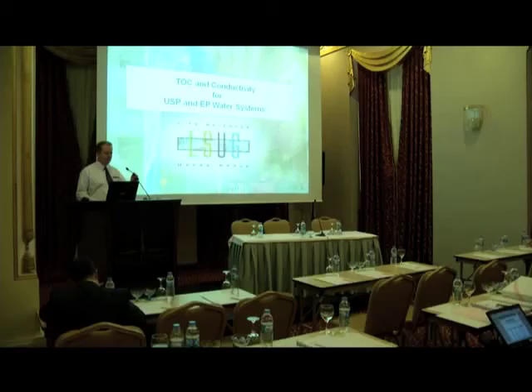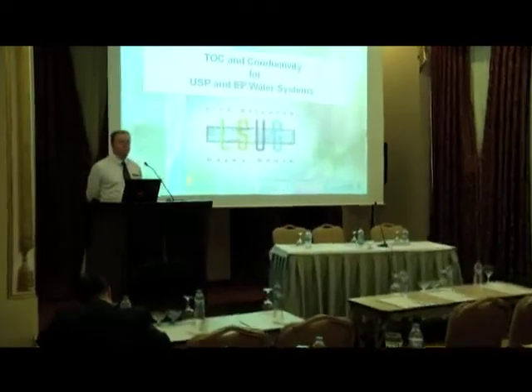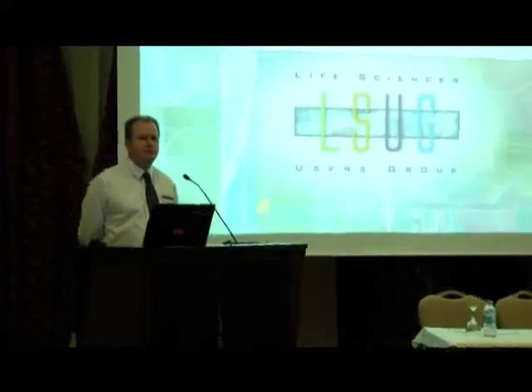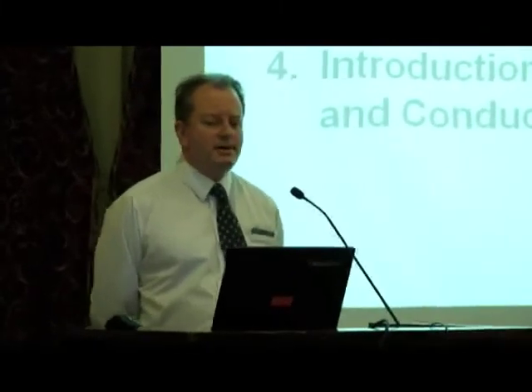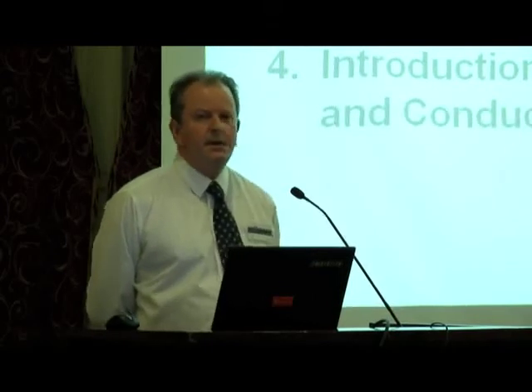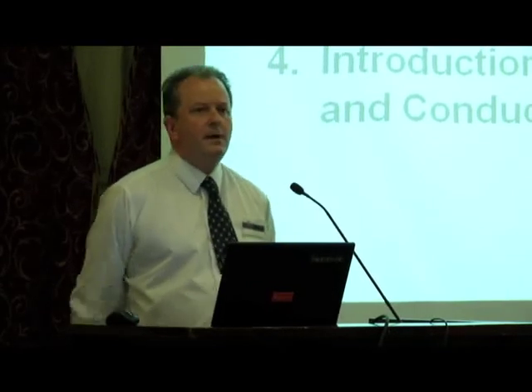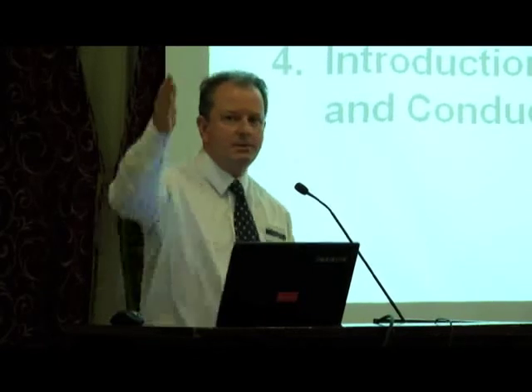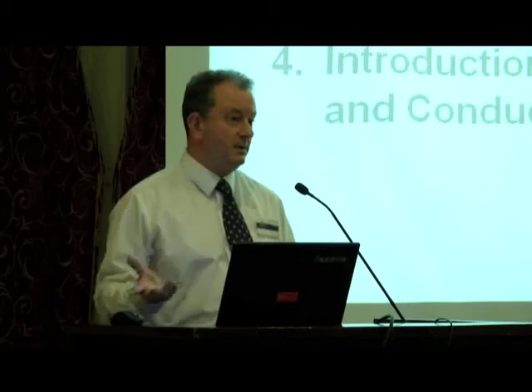Good morning, everybody. Today I'm going to talk about total organic carbon and conductivity in pharmaceutical grade water systems. The content of my presentation will cover conductivity, TOC analysis, a bit about validating a TOC analyzer, and then I will talk about one of the instruments we have brought with us here today, which is on the table over here, the PAT 700 TOC analyzer.